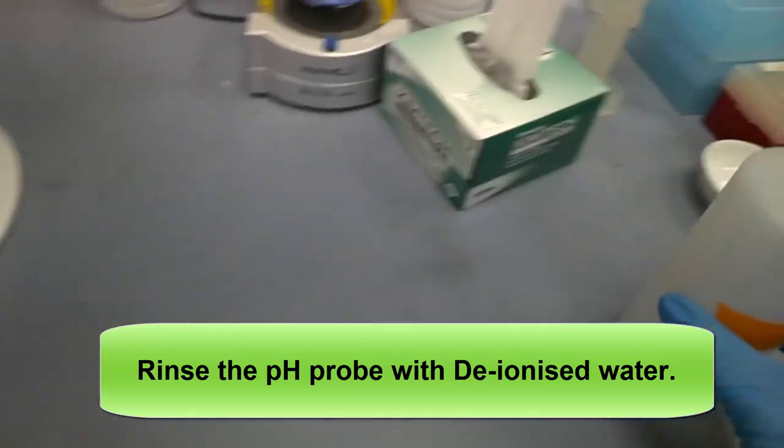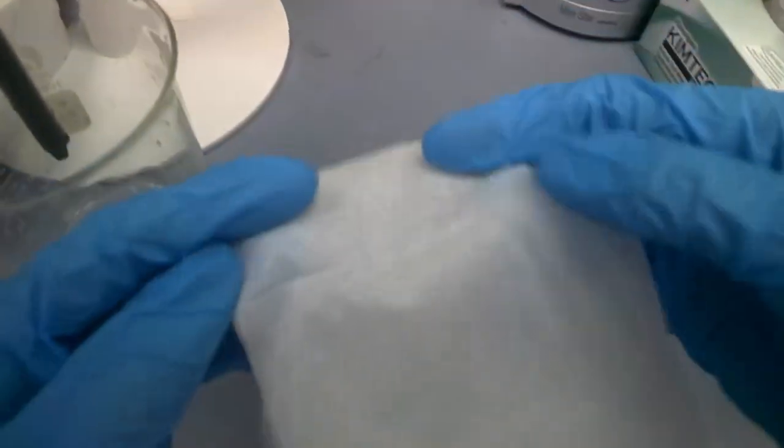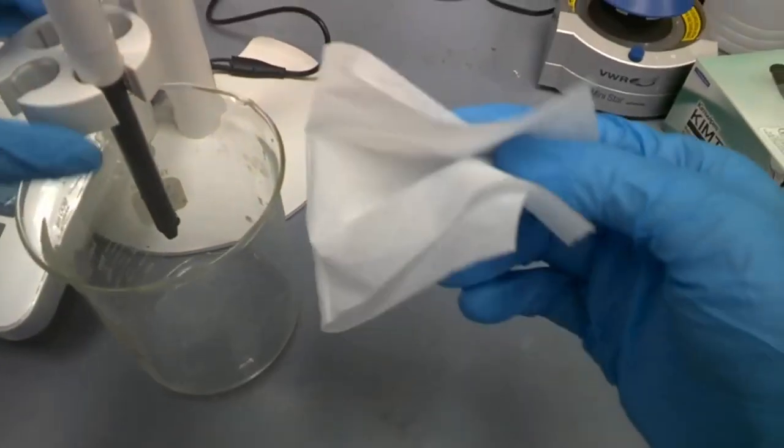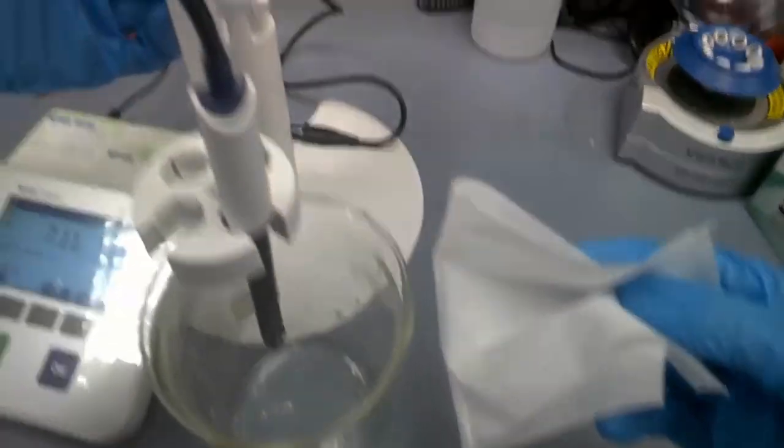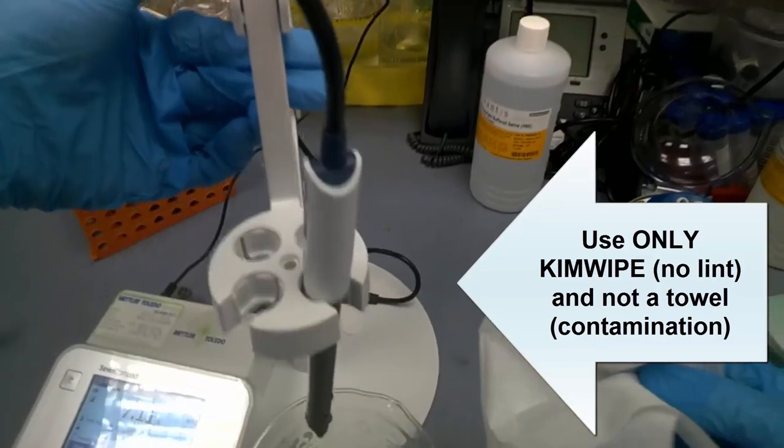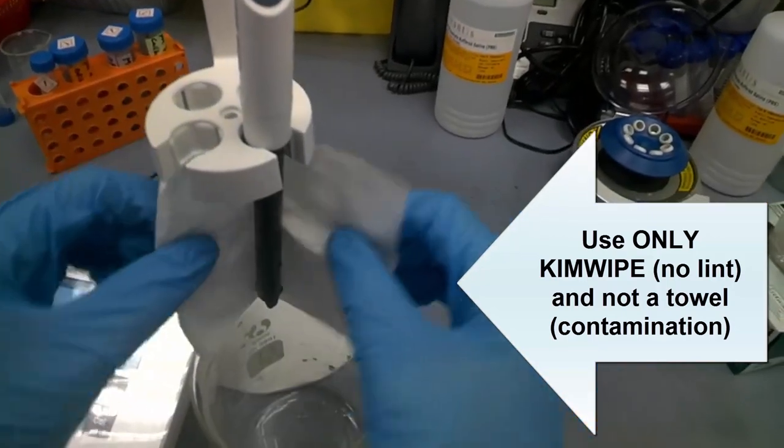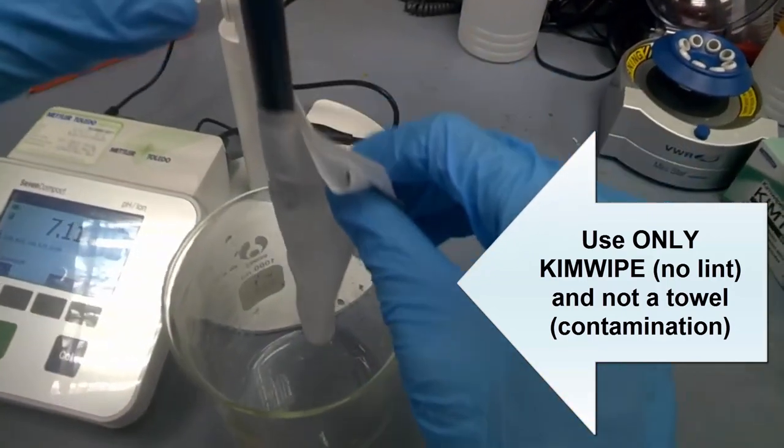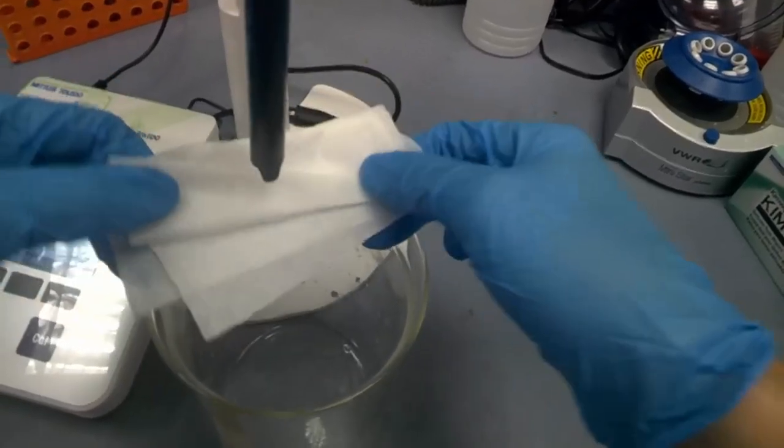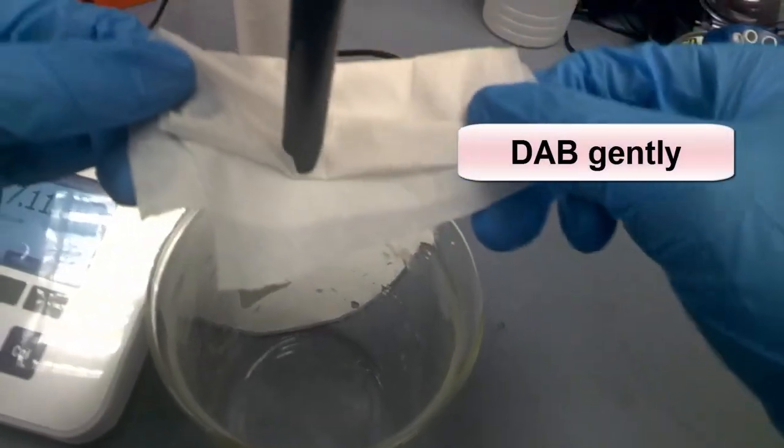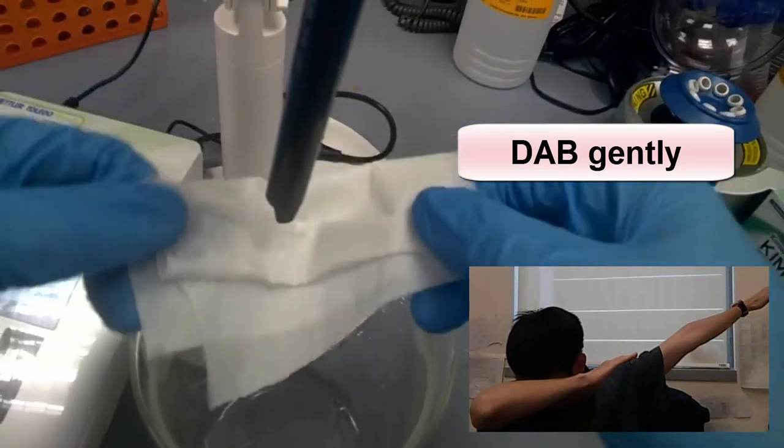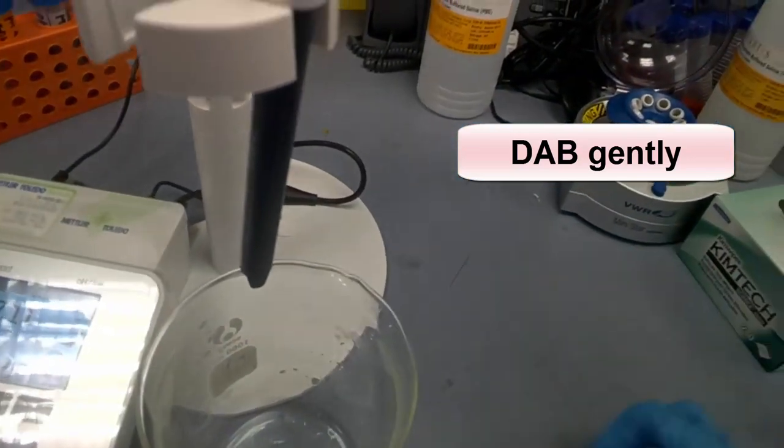Next, we use a piece of kim wipe, folding to halves. Then lift up the arm at this position. Hover around it, just dry it. The bottom part, just dab gently.